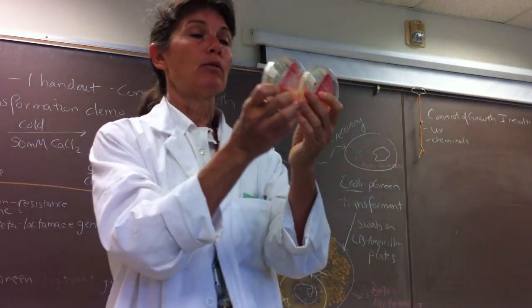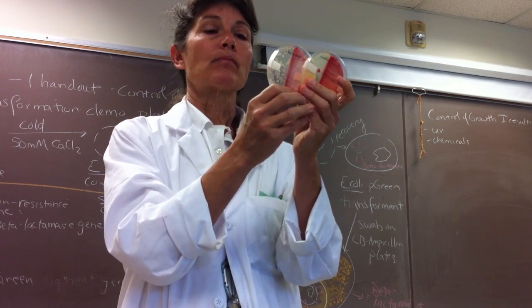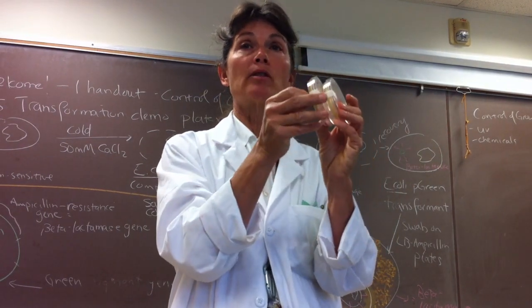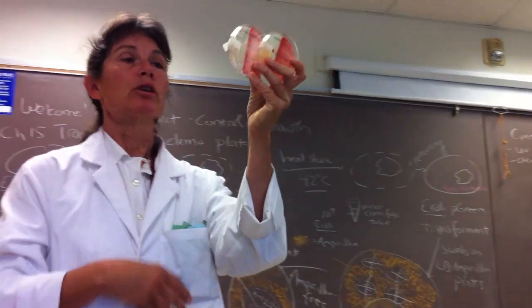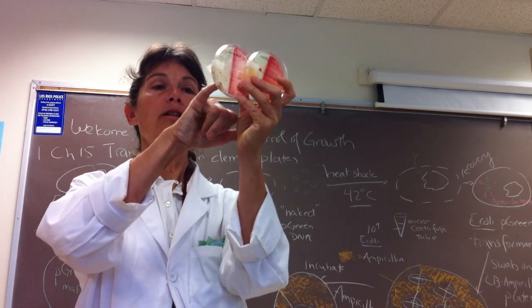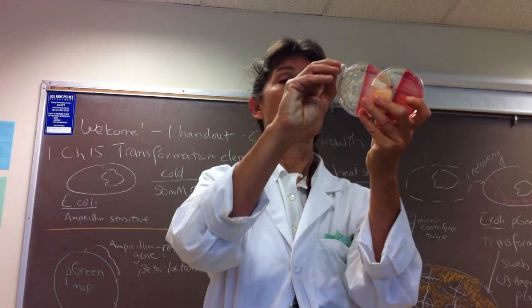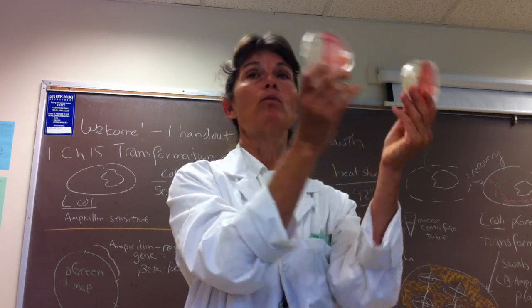What we were looking for was 2 things. We were looking for mutations caused by incorrect thymine dimer repair of our Serratia marcescens. Remember, thymine dimer is the abnormal DNA structure that's formed following UV irradiation. So on the irradiated side of your plate, you're going to look for smaller colonies and colonies that are no longer making pigment. You'll also notice there are fewer colonies on the irradiated side. So that's telling us that UV irradiation also did what to our bacteria?